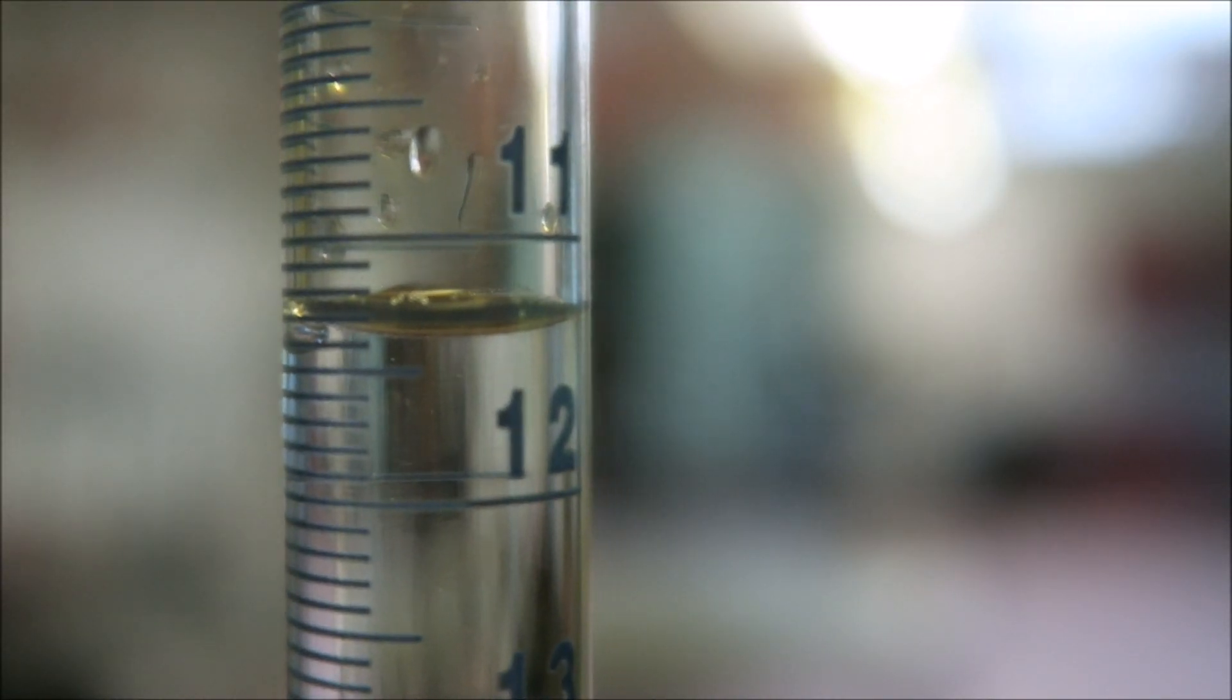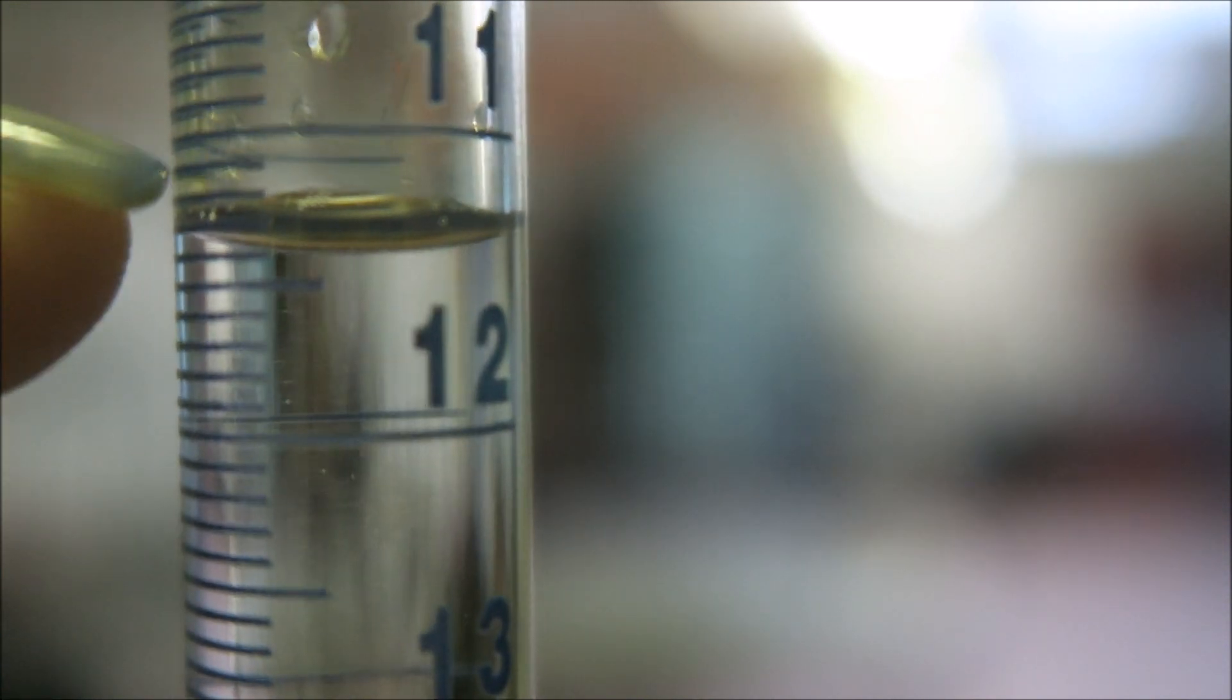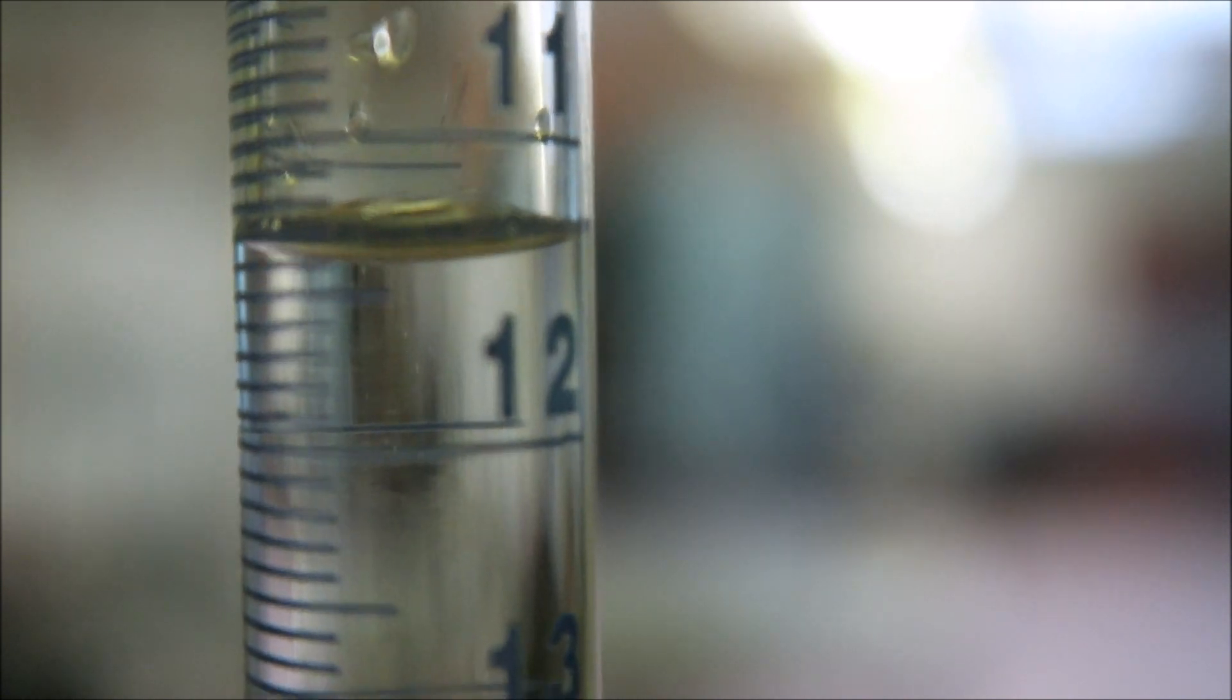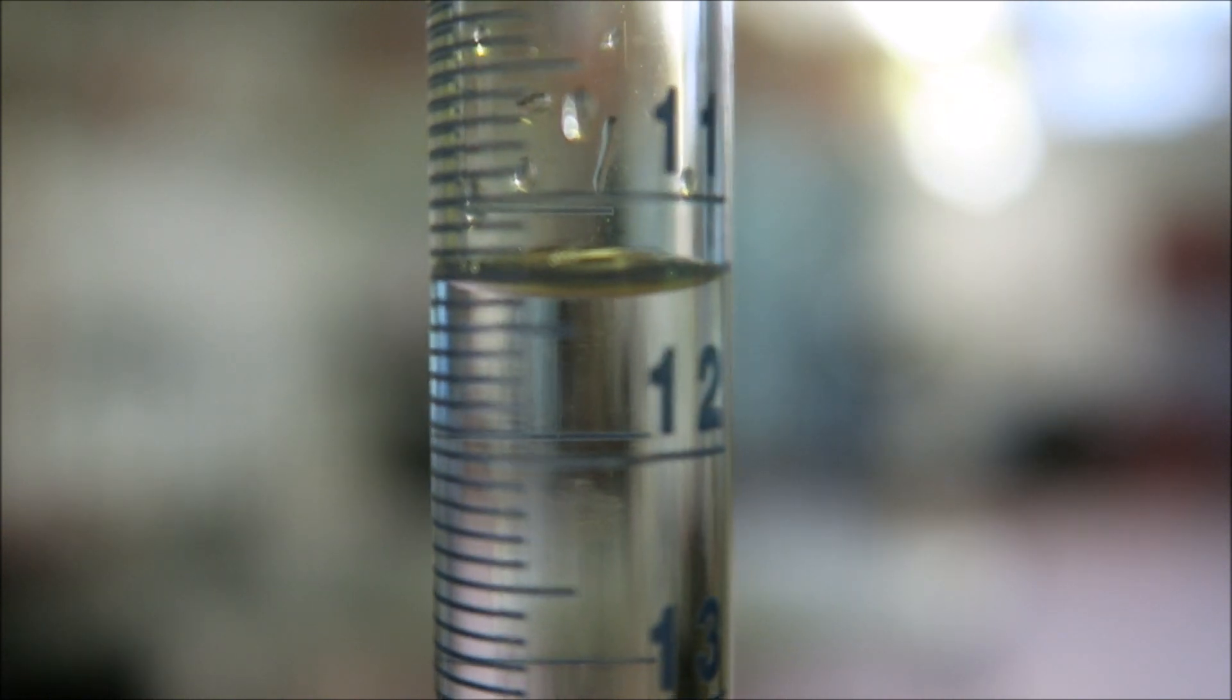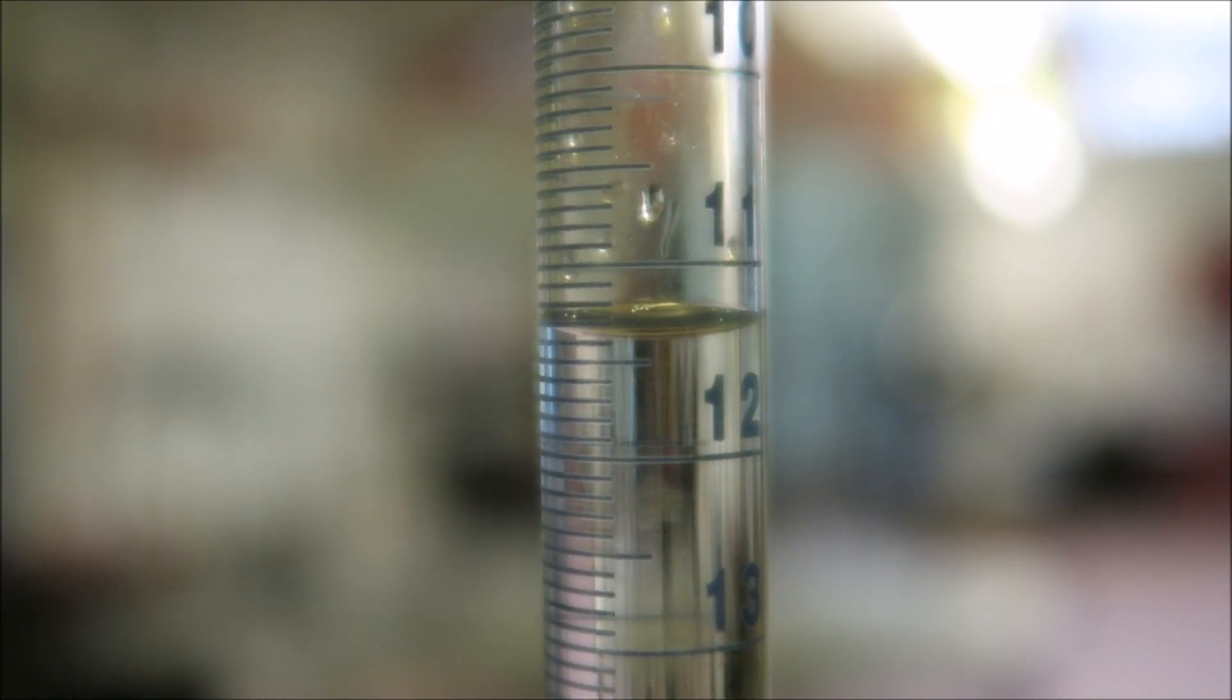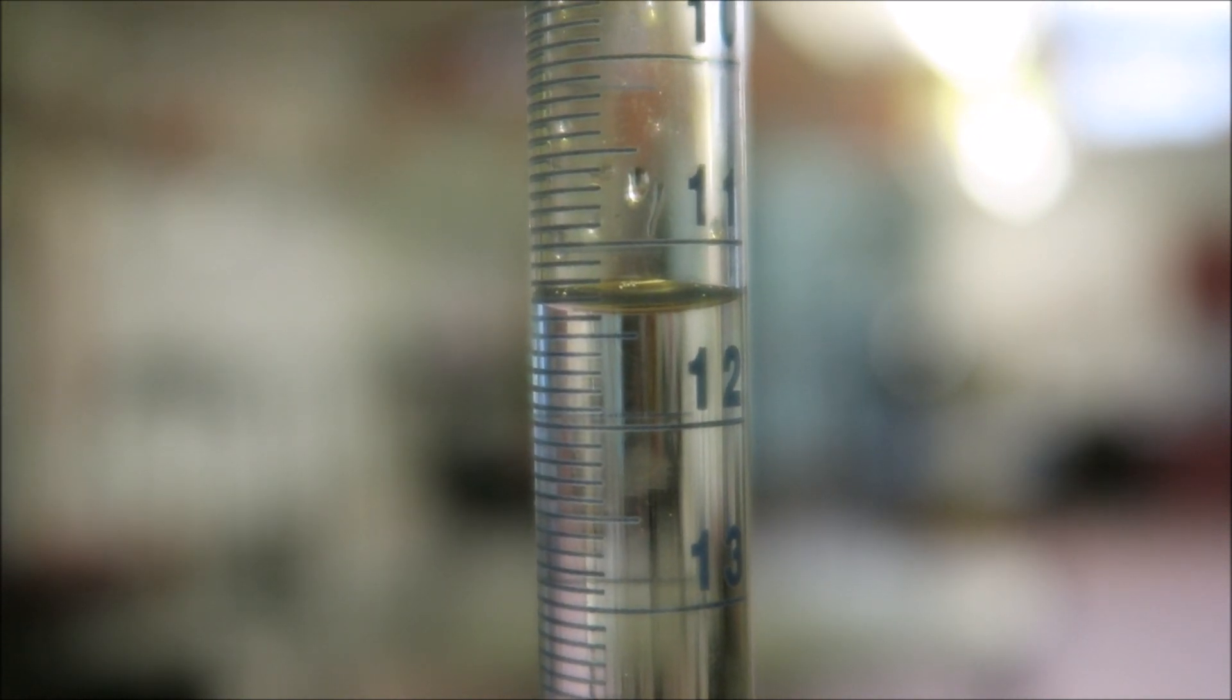When you read a burette, you need to look for the bottom of the meniscus. You can see here is 11, here is 12, here is 0.5. So this is 11.1234, and this is exactly 11.4. In a titration on a burette, you can see whether it's exactly on the number or between the numbers. This is the level of accuracy we are aiming for in a titration. You need to do it to two decimal places, so this would be 11.40.